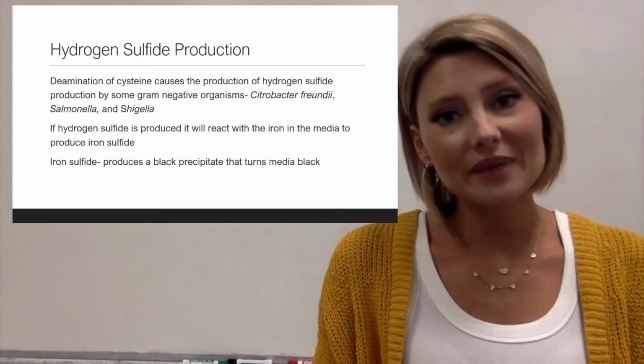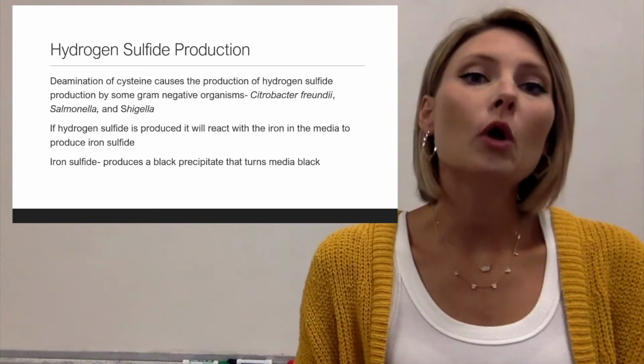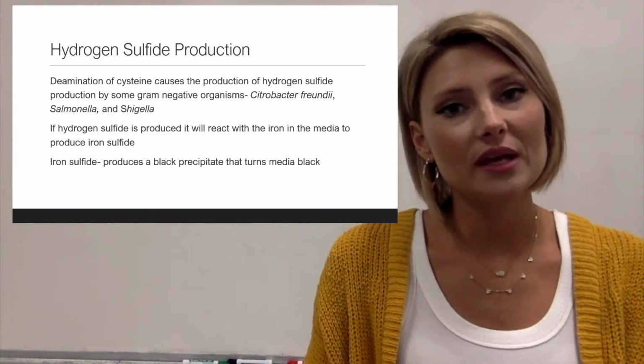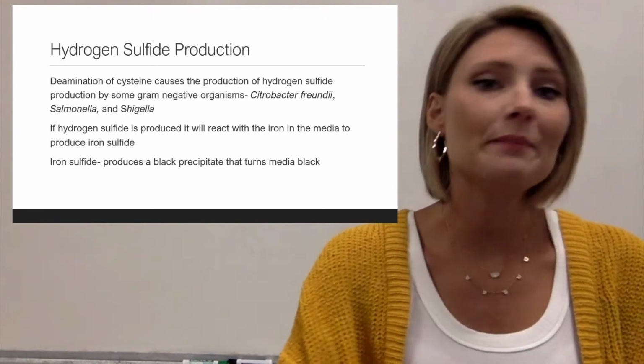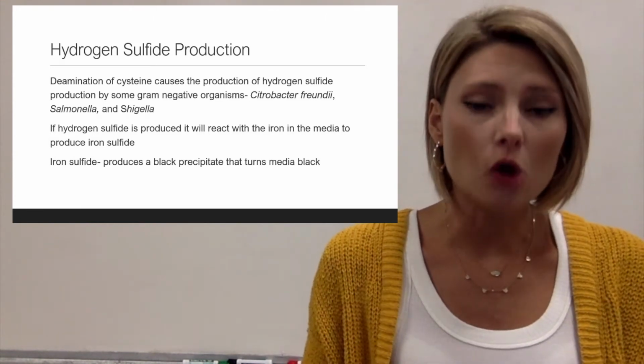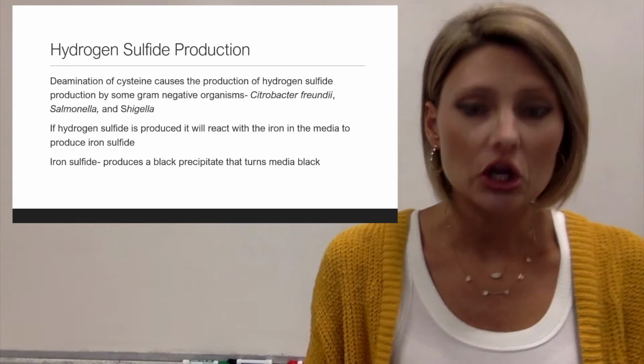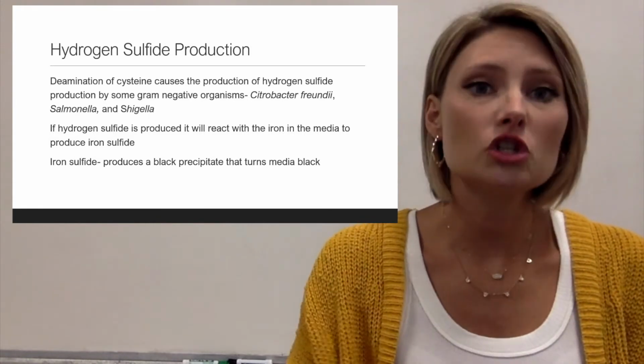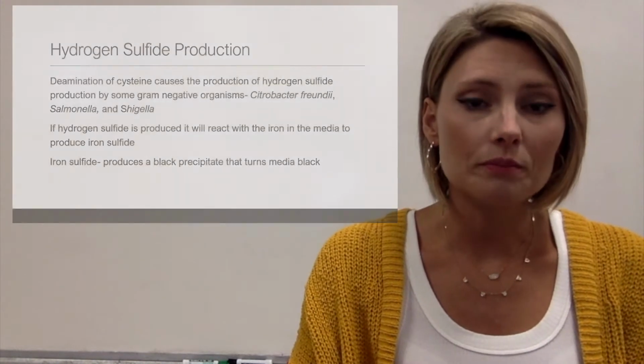Whereas more common intestinal bacteria, non-pathogenic strains, will be negative for hydrogen sulfide and be positive for indole, or positive for the tryptophan degradation. So this helps us to tell the difference between pathogens and just more common intestinal bacteria.